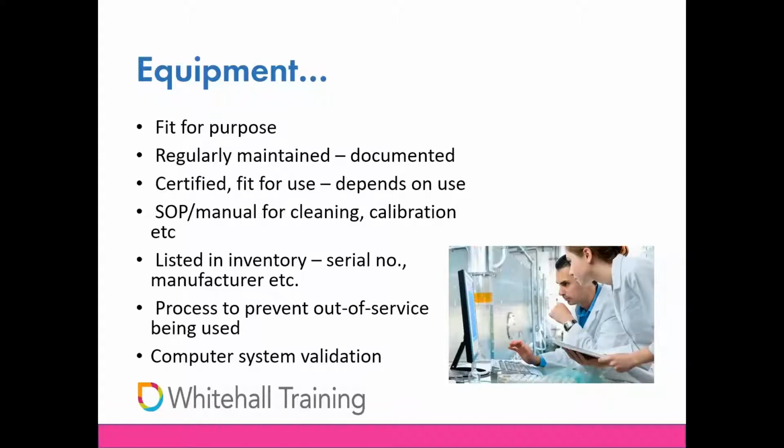Okay, this is an important point. When equipment's out of service, you need to have some sort of process in place to make sure it can't inadvertently be brought back into service. So it can't inadvertently be used by staff. And you need to ensure that any impact to a clinical trial of this thing being brought back into service is dealt with in a very timely manner.